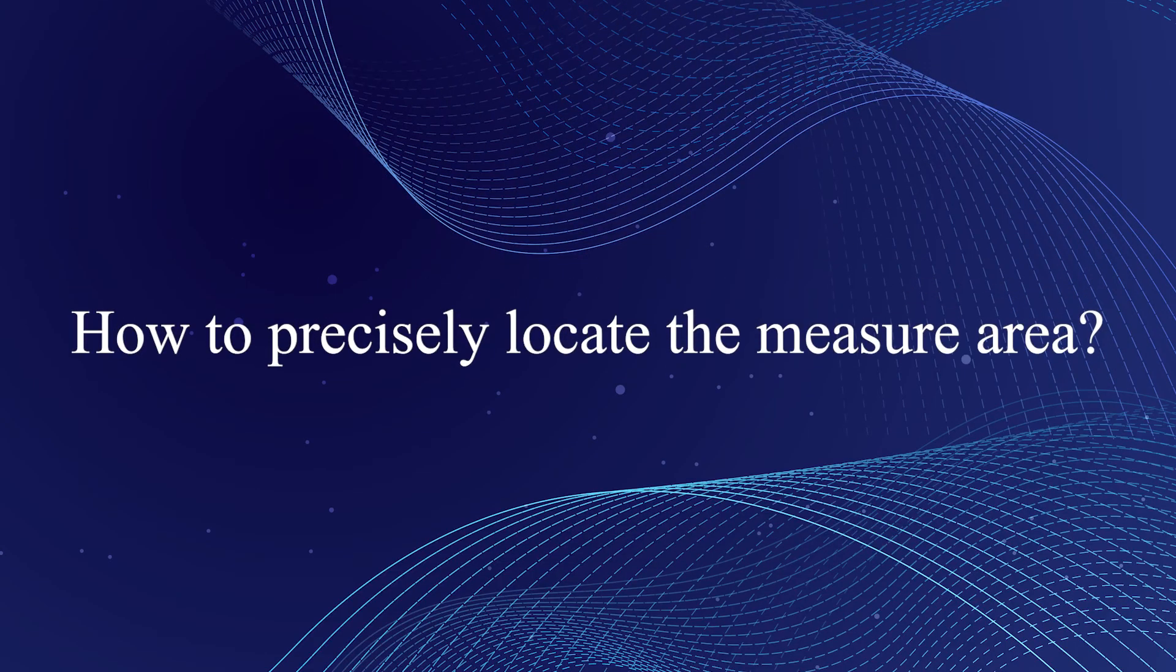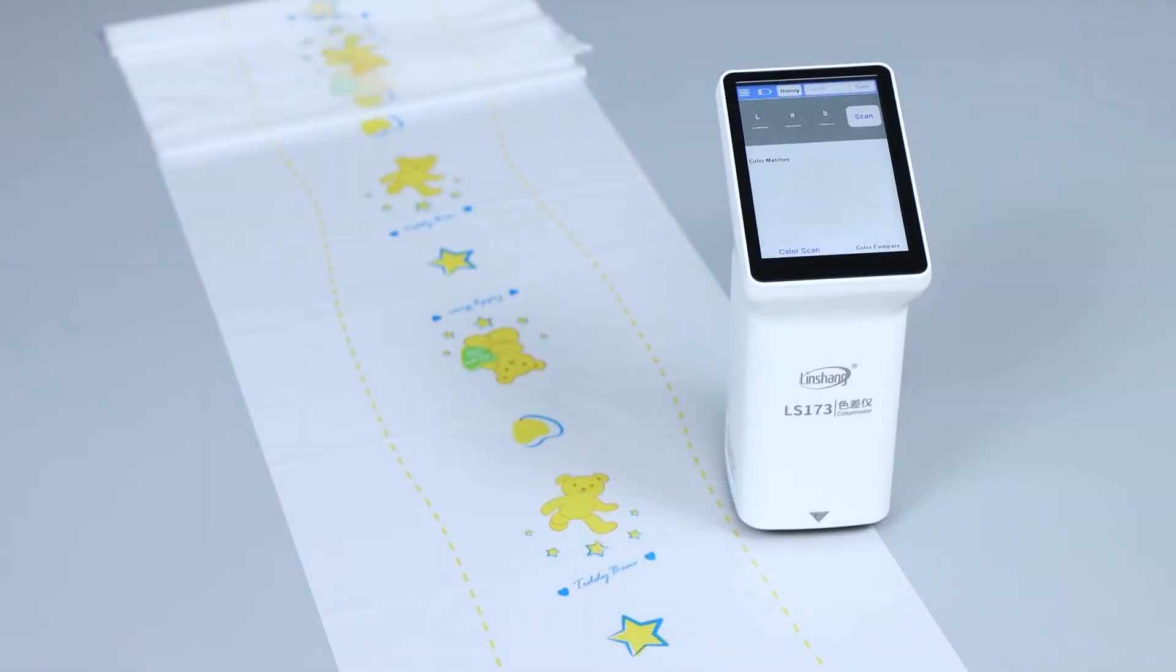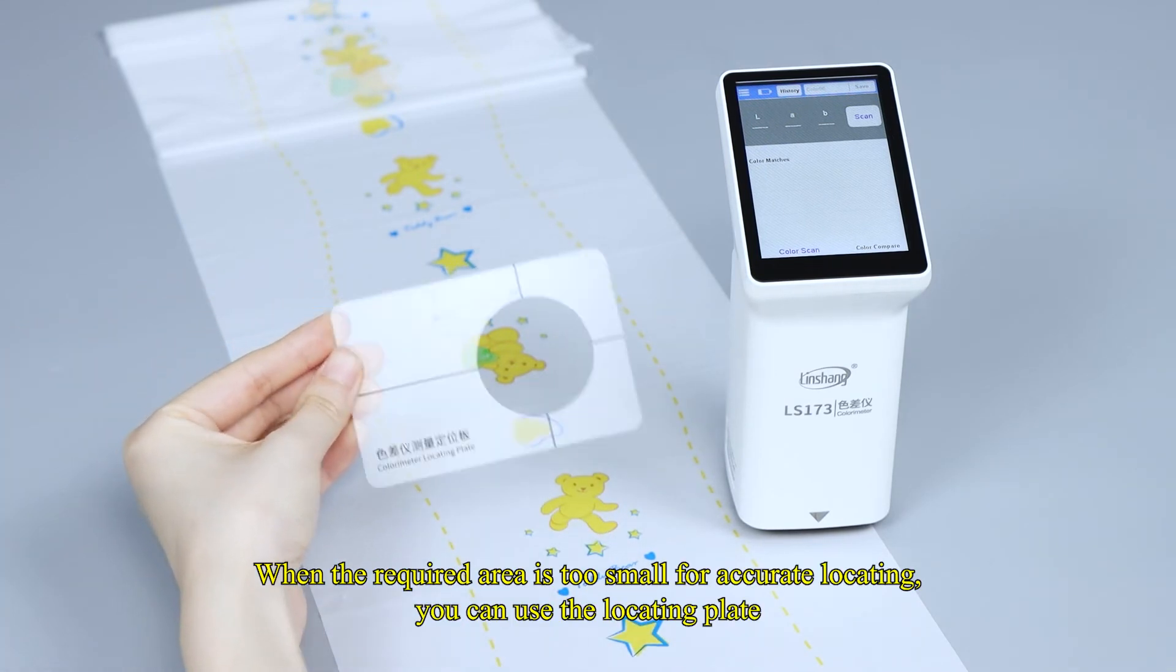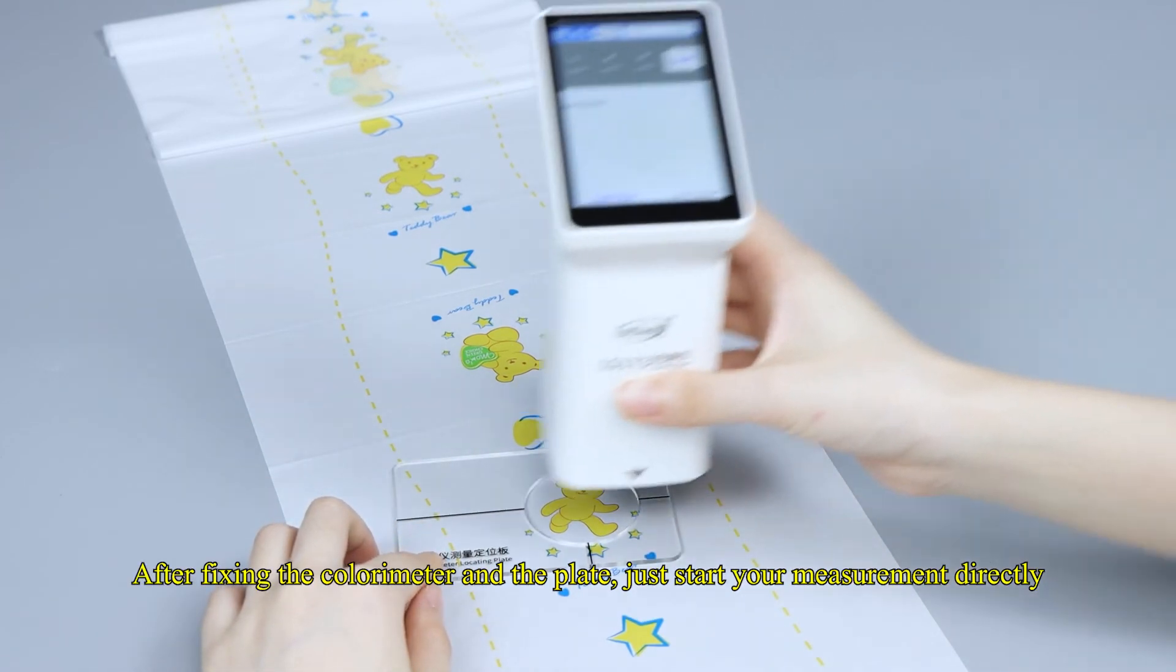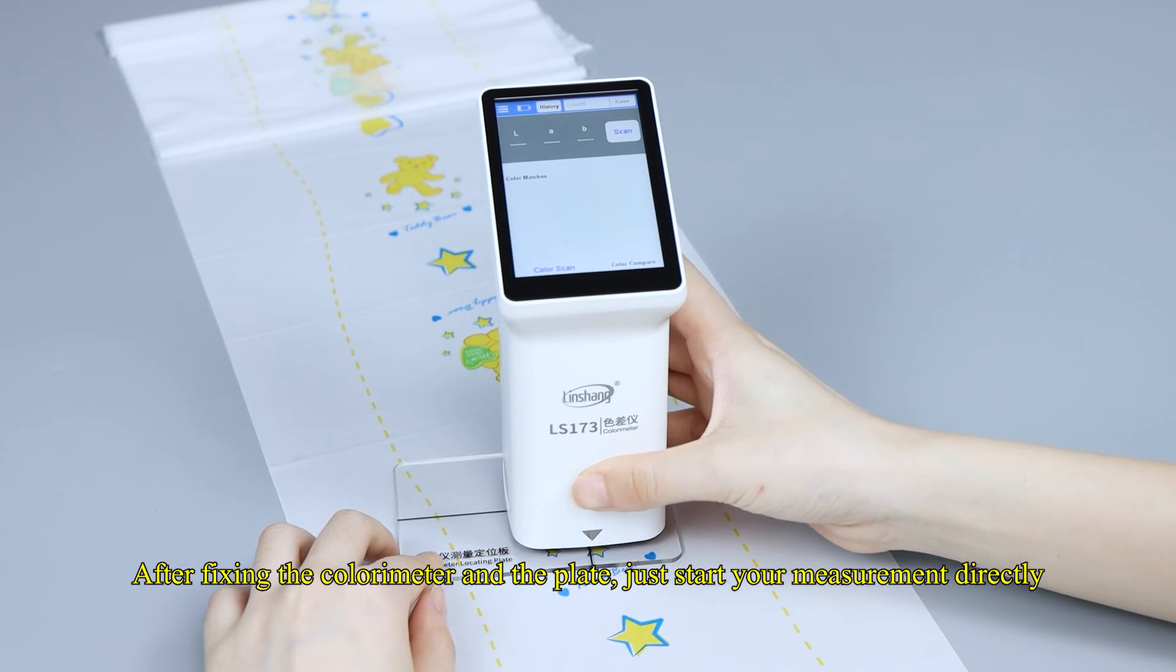How to precisely locate the measure area. When the required area is too small for accurate locating, you can use the locating plate. After fixing the colorimeter and the plate, just start your measurement directly.